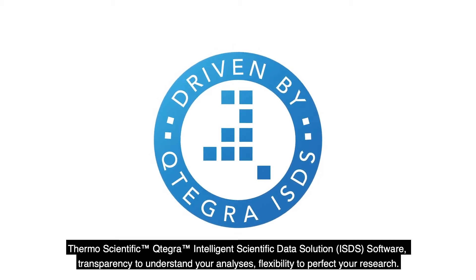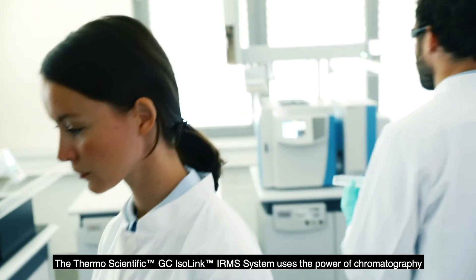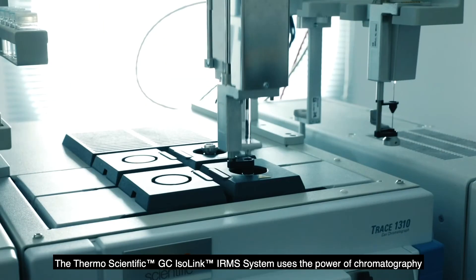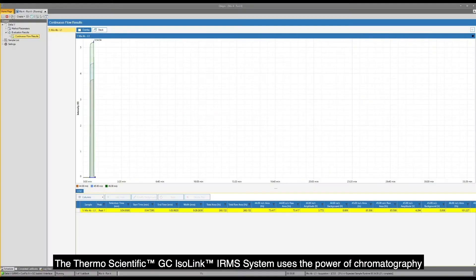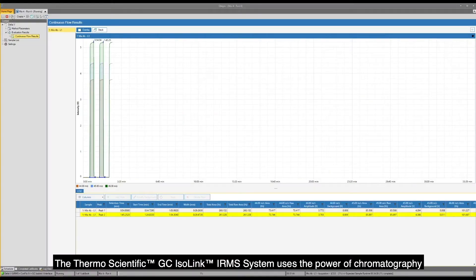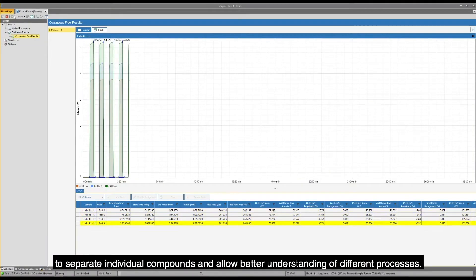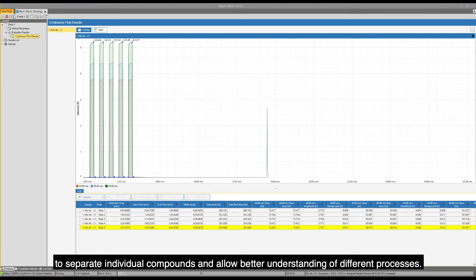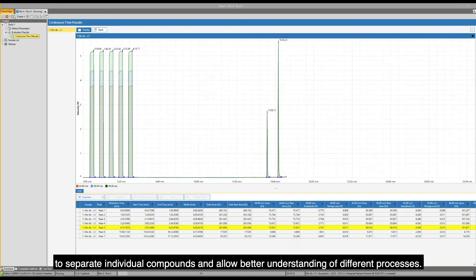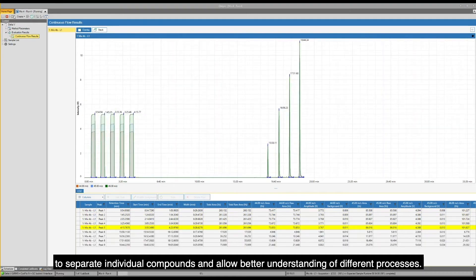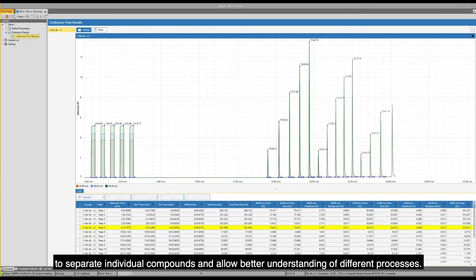The ThermoScientific GC Isolink IRMS system uses the power of chromatography to separate individual compounds and allow better understanding of different processes.